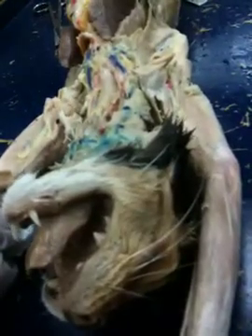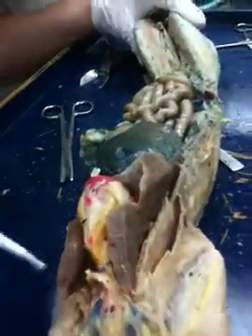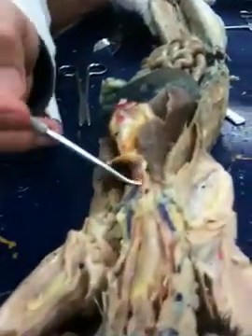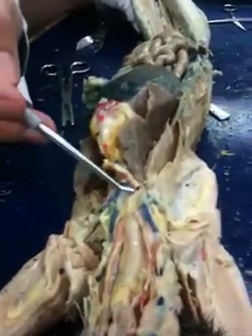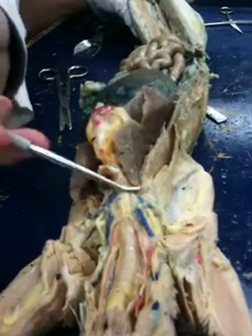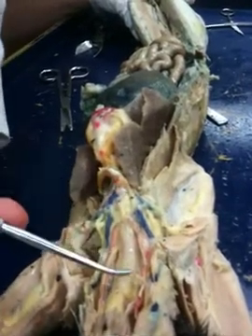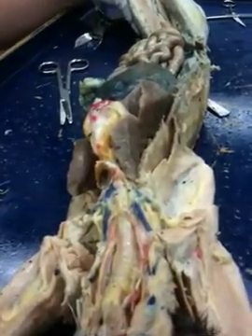Coronary artery and veins on the heart, you'll need to know that. You'll need to clean out the fat on Thursday. The thymus gland, you actually cut it out a little bit. It kind of looked like a piece of the fat here, but it's that right there. And in the younger cats, it extends all the way up to here. Y'all had an older cat.